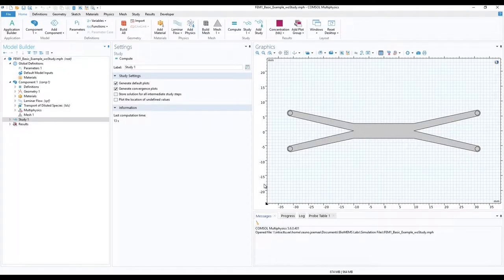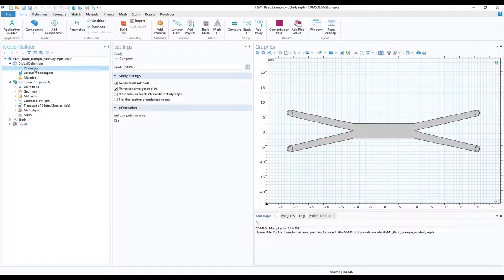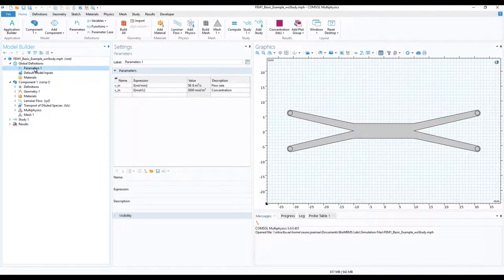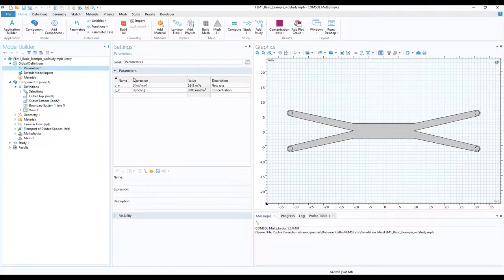In previous lab we went through the use of boundary probes and globally defined parameters, which are helpful for us in this lab as well. In the model builder ribbon, in parameters 1 under global definitions, we should have our flow velocity and concentration fixed.